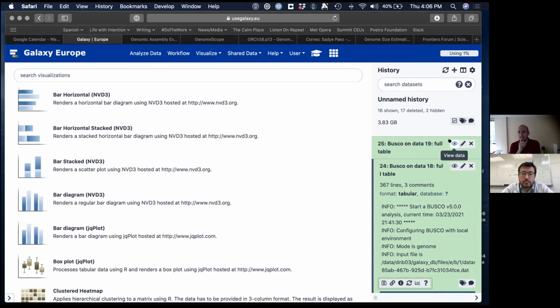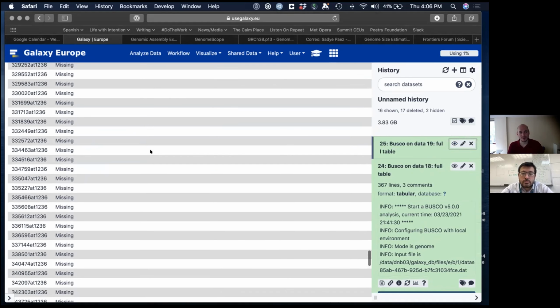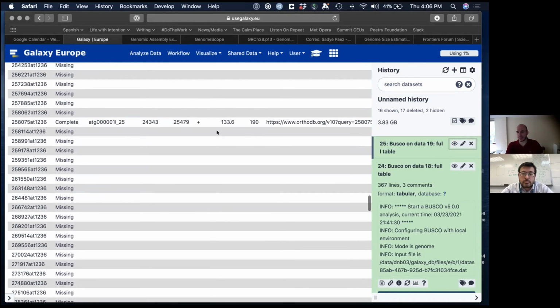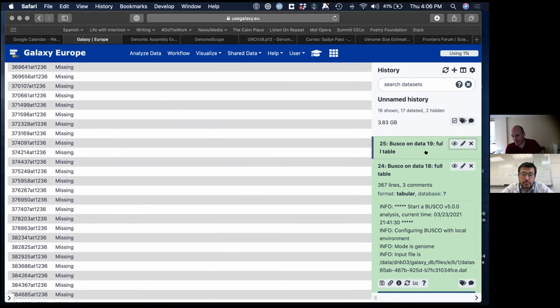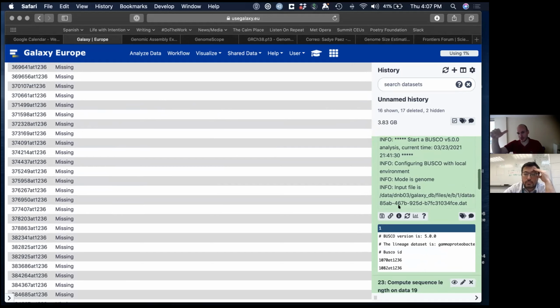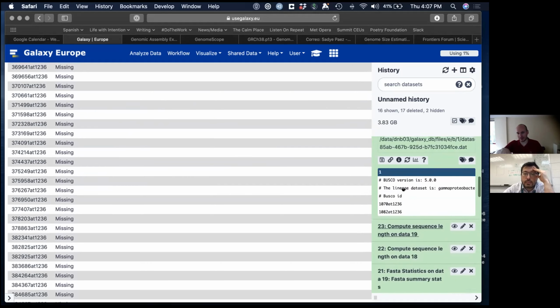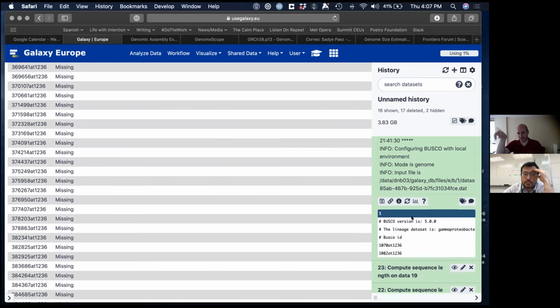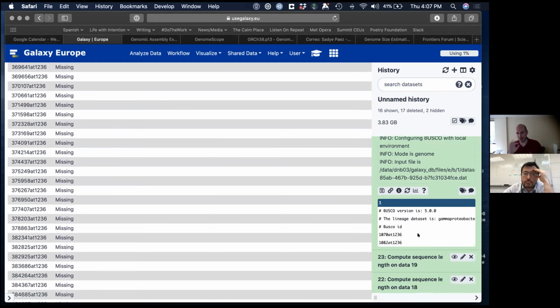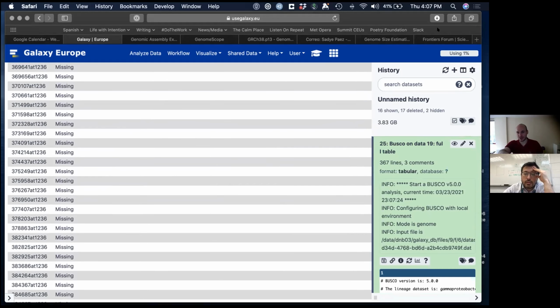I don't know. I know I looked at the alternate, which in this case with E. coli, there's nothing, right? Because we already saw two, or maybe there's one thing. Maybe you deleted it or hidden, there's something hidden. What do you click on? I'm sorry, I missed it. Under a named history on top, there is 16 shown, 17 deleted, 2 hidden. You don't have to scroll, it's right there where there is the gray area, up in the page.